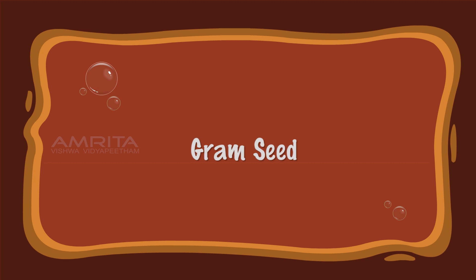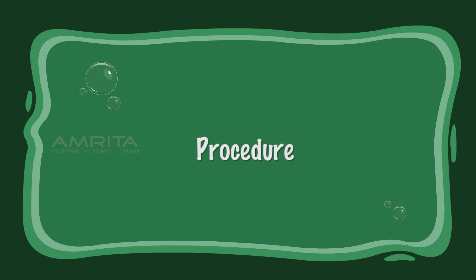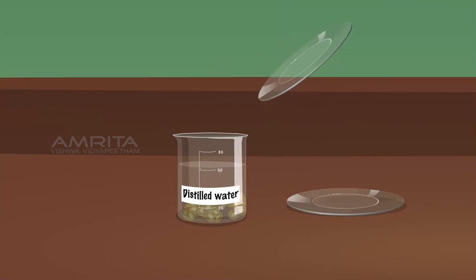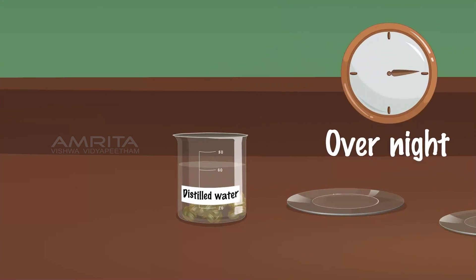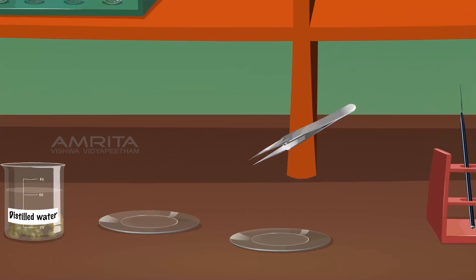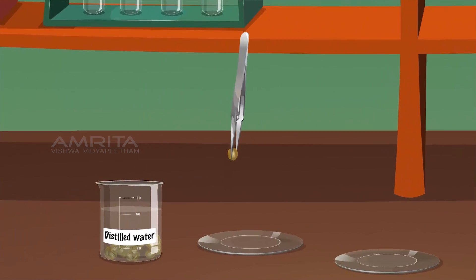Gram Seed. Procedure: Place a few gram seeds in a beaker containing distilled water. Soak the gram seeds overnight. Using a pair of forceps, pick one seed from the beaker and place it in a watch glass.